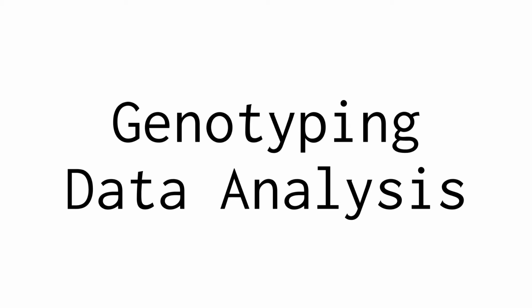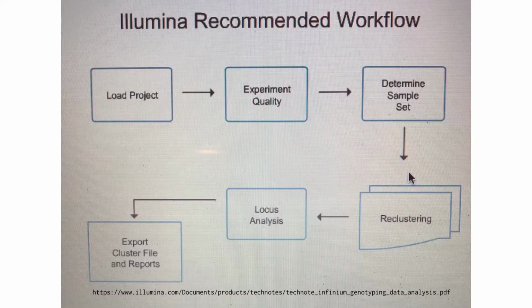This video is going to talk about the processes and methods used to analyze the genetic variation of the samples found by the SNP assays. The program that we use is called Genome Studio. The basic process of calling SNPs using this software is built on a 6-step workflow process.